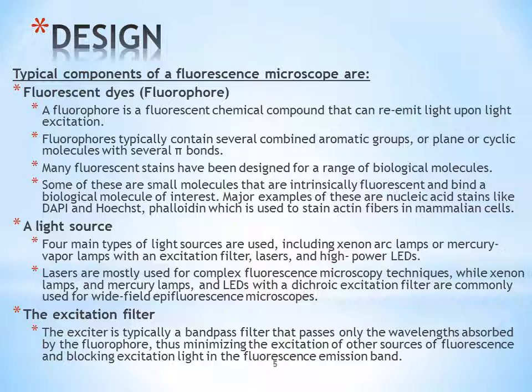Now let's discuss the design of the fluorescent microscope. Typical components of a fluorescent microscope consist of fluorescent dyes, the light source, and the excitation filter. Fluorescent dyes, that is, fluorophores. A fluorophore is a fluorescent chemical compound that can re-emit light upon light excitation.